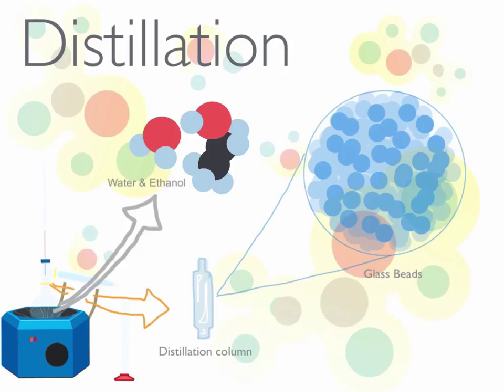Distillation is an extraction technique used to extract a molecule of interest from a solution by utilizing its boiling point. A molecule's boiling point is governed by its structure and the intermolecular forces it's able to employ. In this experiment, ethanol was extracted from water.